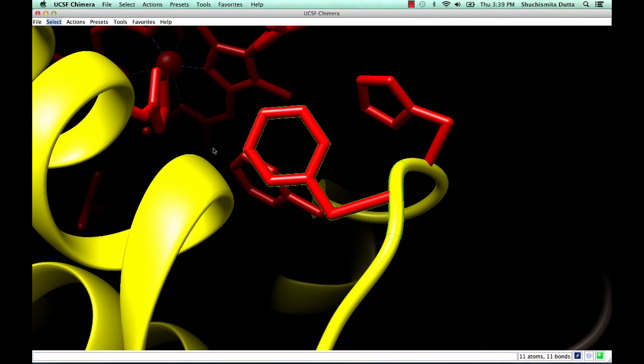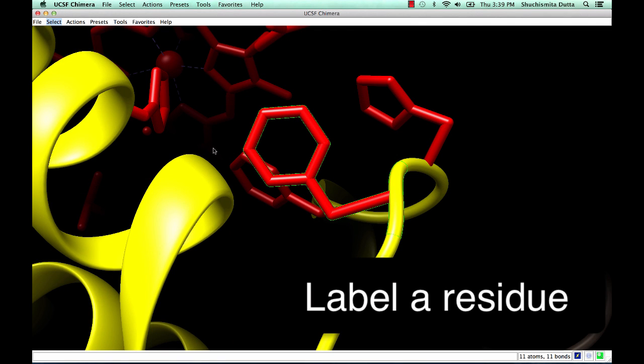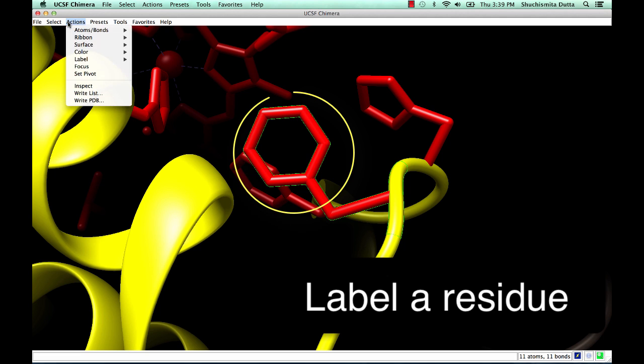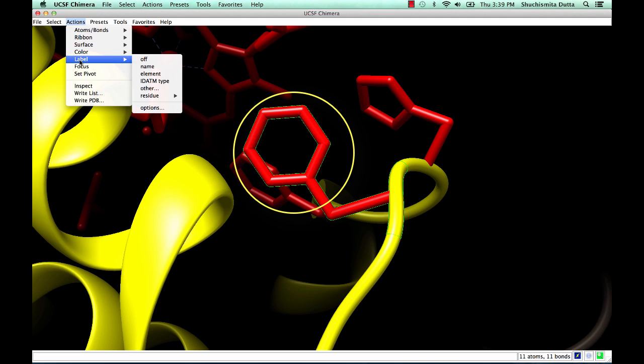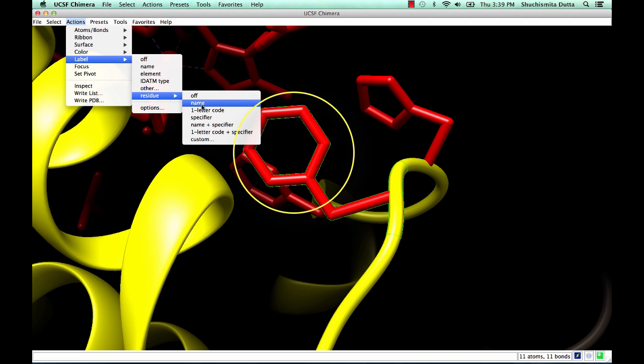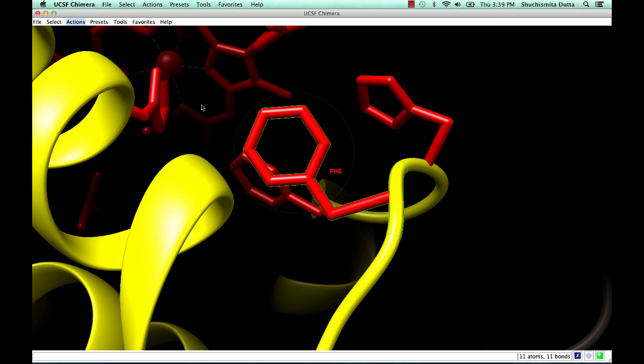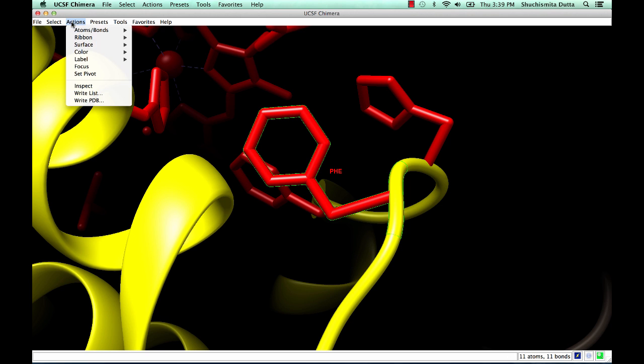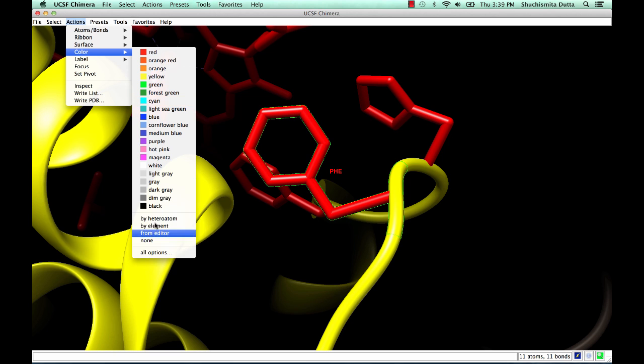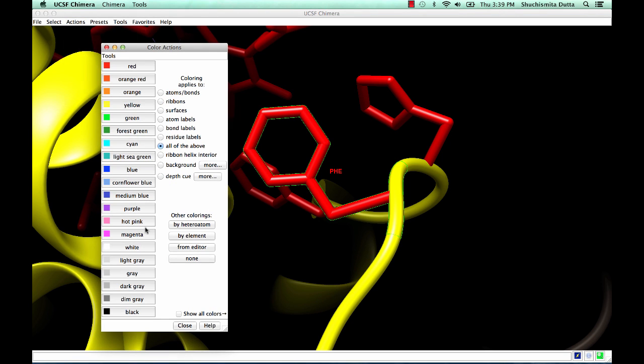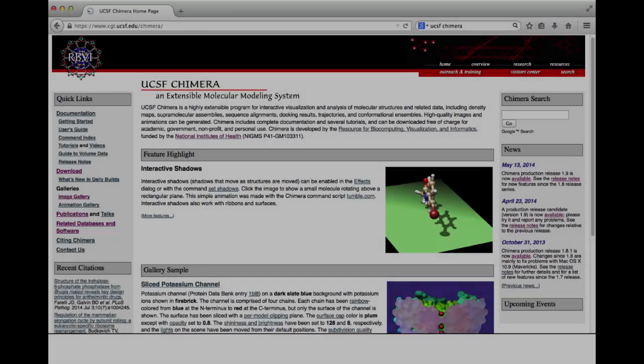To label a residue that you have selected, click on the Actions Label Residue Name option, and the residue label will show up. You can change the color of this label using the Color menu, specifically by changing the residue label color.